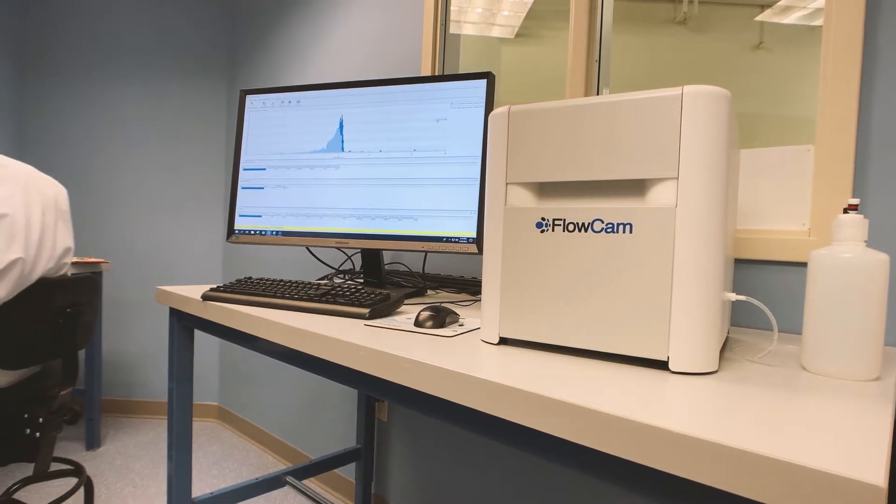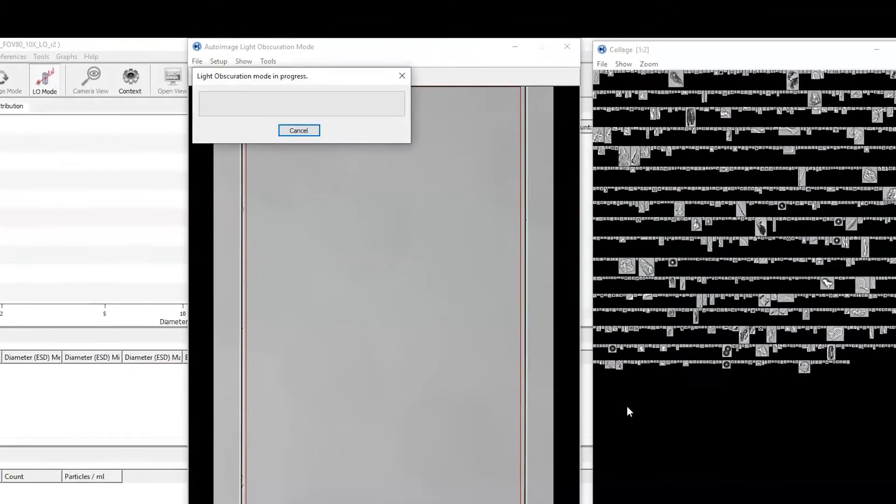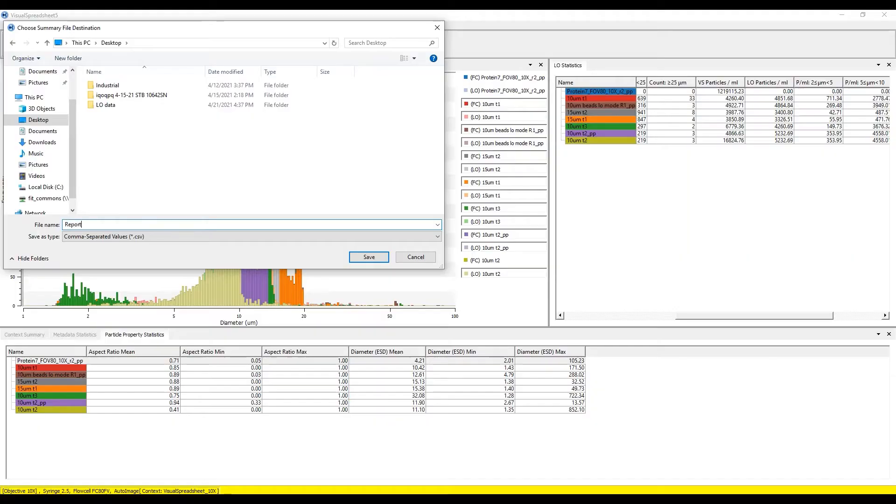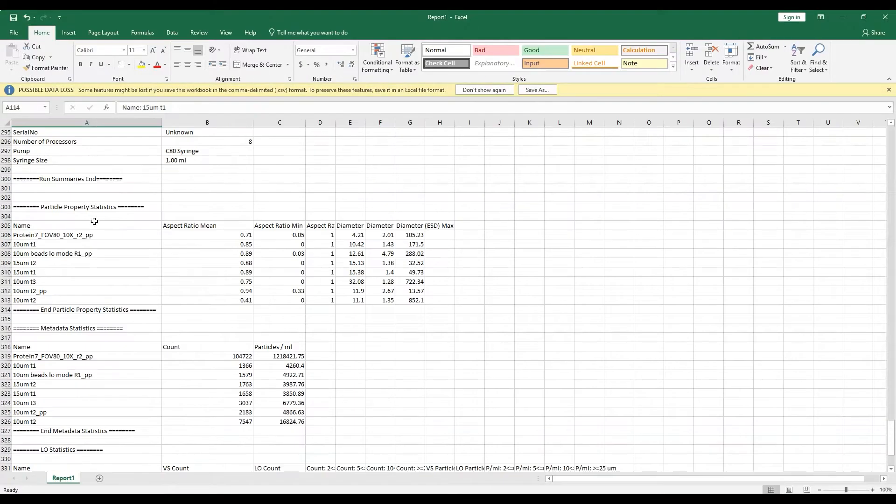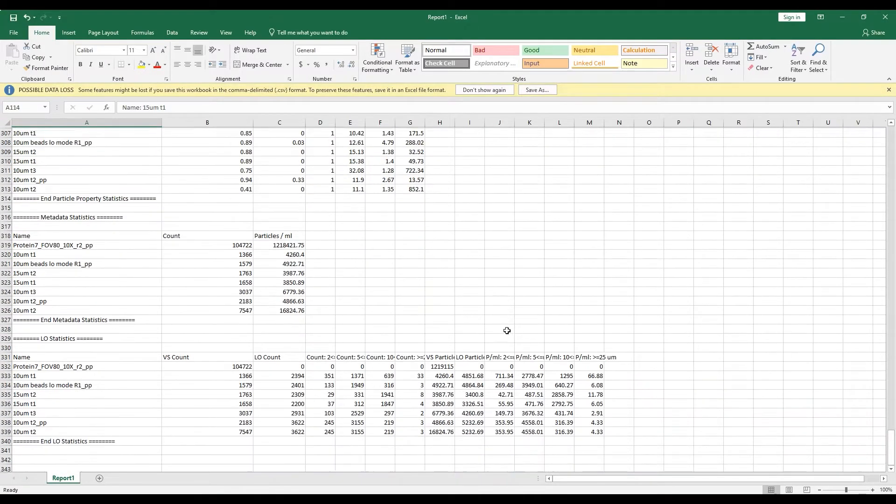The first of its kind, FlowCam plus LO allows for this to be accomplished in a single run and exported as a single report, saving you time, sample, and resources.